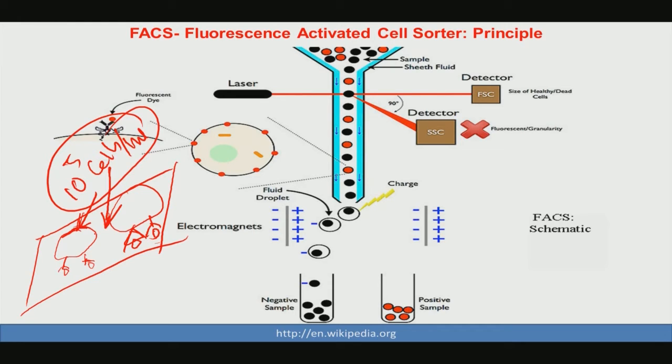They will produce the results in bulk, in the sense that they will tell you that this much fraction of the cells are live or this much fraction of the cells are dead, but you do not have access to individual cell-specific information. For example, it will not give you the exact number of cells that are in reality live or the number of cells that are non-living.